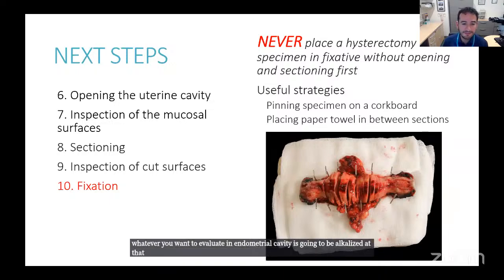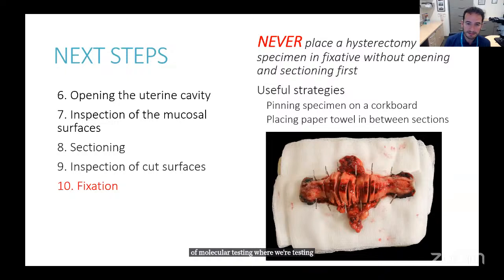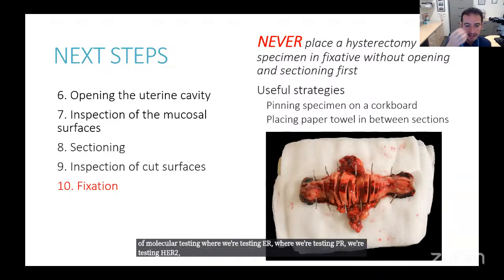So I cannot emphasize this enough. And in practices where we now have availability of molecular testing, where we're testing ER, PR, HER2, and other molecular modalities, fixation is so important. So this point cannot be overemphasized enough.